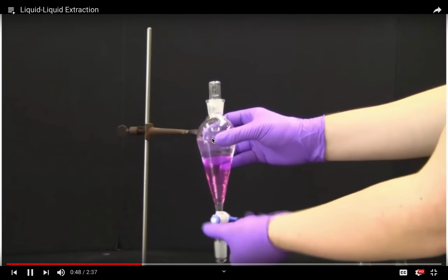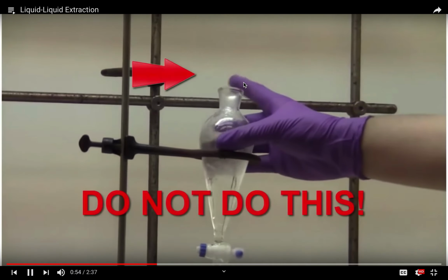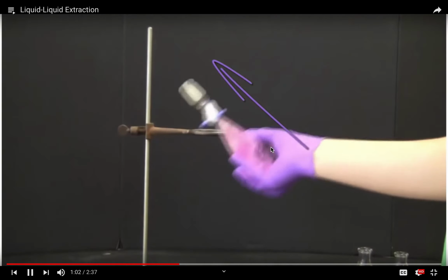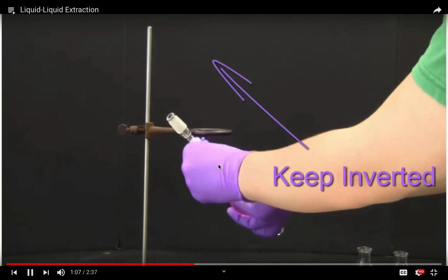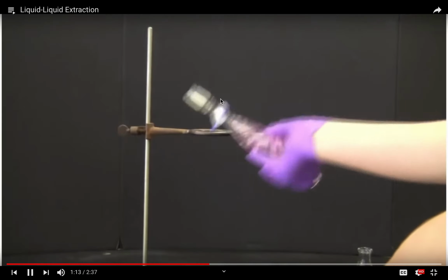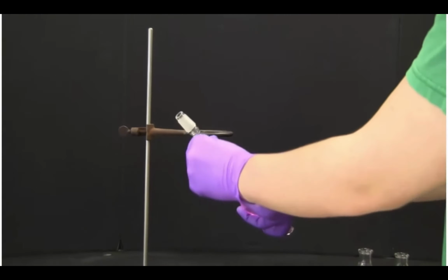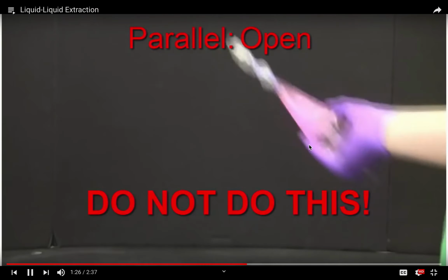You close the stopcock, secure the stopcock and the cap, then mix it. But never do this. When you shake it, invert it, there is a lot of pressure buildup, so point it towards the inside of the hood. Then you have to ventilate it constantly to relieve the pressure inside. Don't do this as well, it will cause lots of leaks around the stopcock. So ventilate it until you don't hear any hissing sound or any gas coming out. So don't do this kind of shaking.